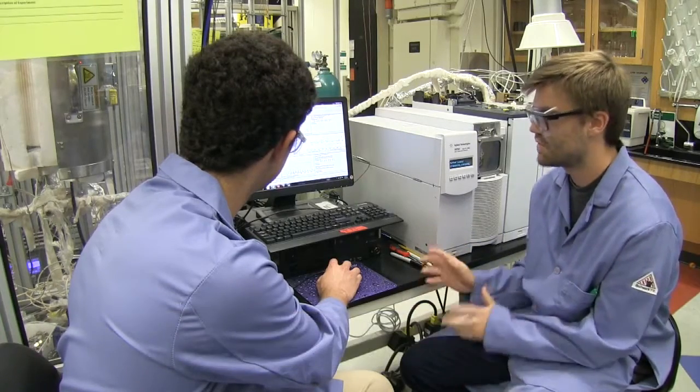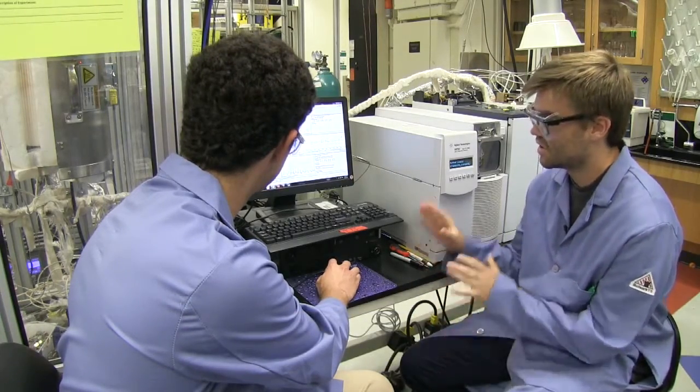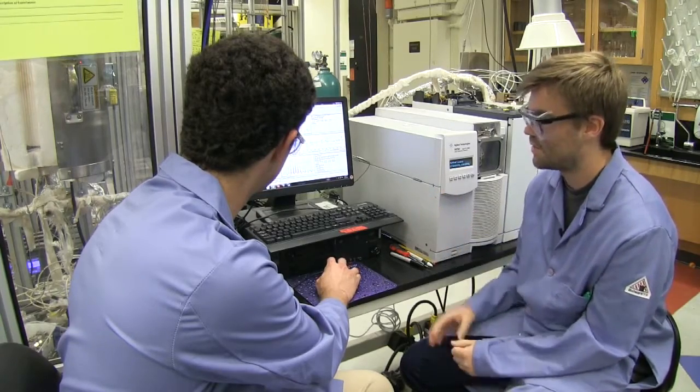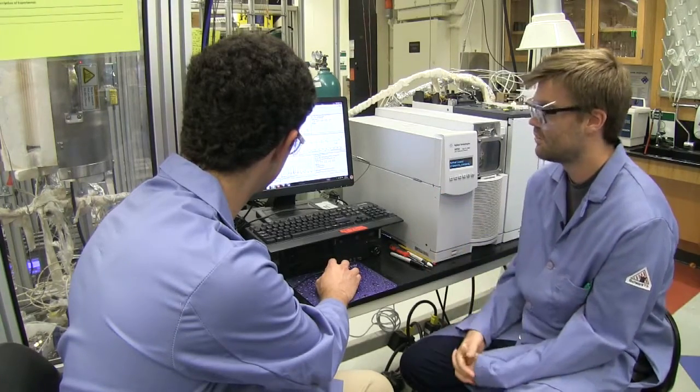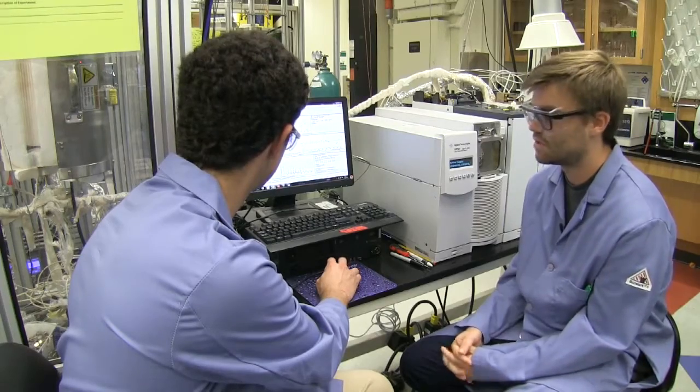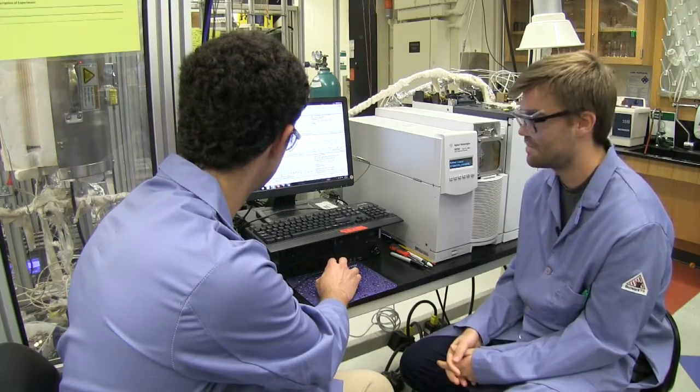We have to be really careful when we're analyzing the GC-MS spectra from these runs because it makes such a wide variety of compounds. But you want to think critically about what could have been possibly made based on what we started with and what reactions are going to be happening in the system.